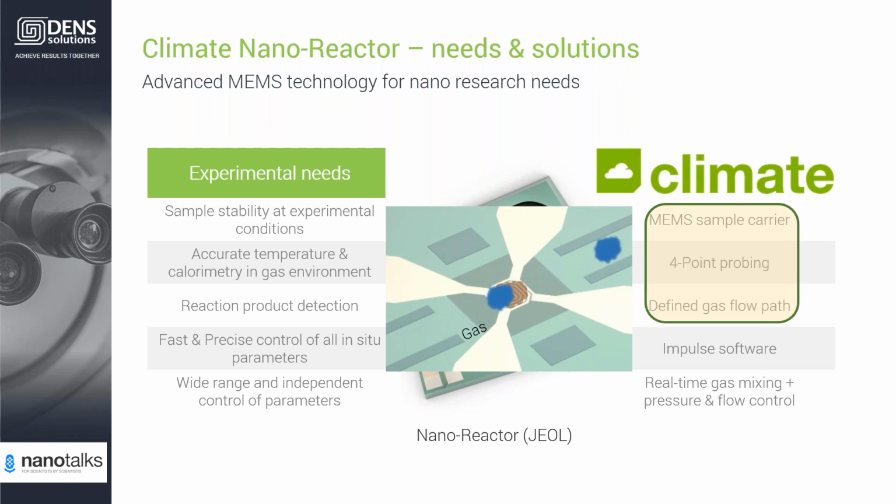So there is a maximum chance of gases interacting with the heated sample. Sample is heated by a current via these two probe lines, and then we use the other two probe lines to measure the resistance of the heater, and via the resistance and the calibration process we know exactly what the temperature of the heated sample is.